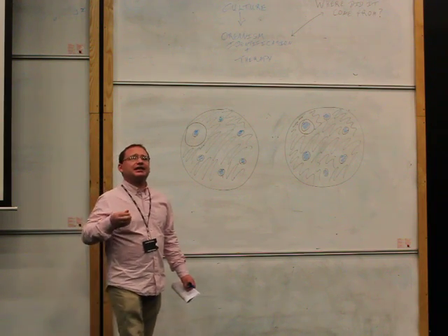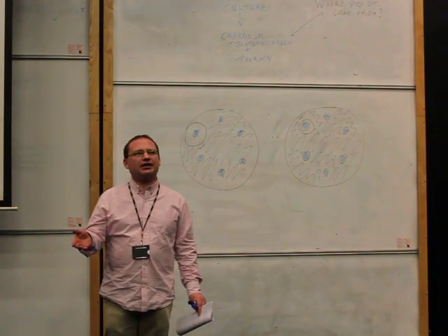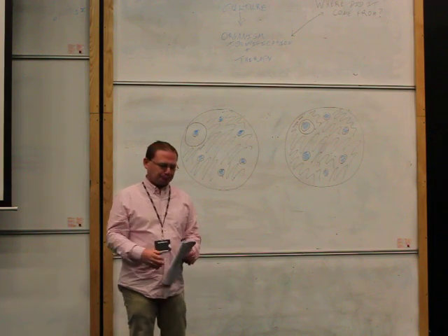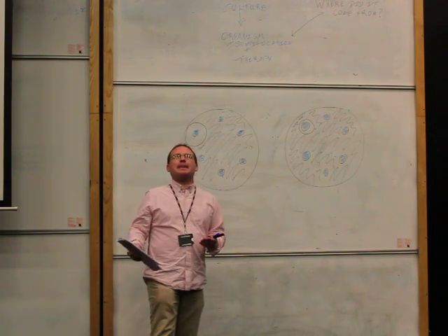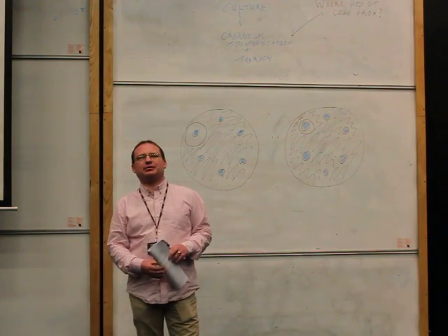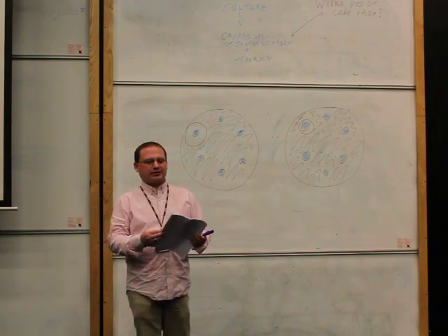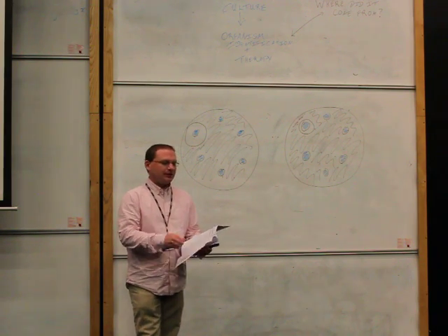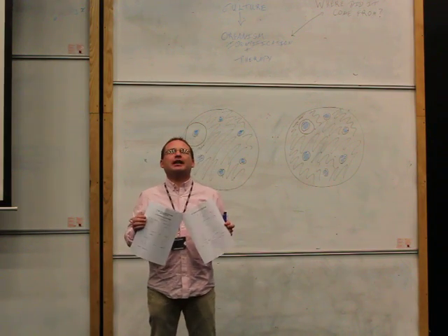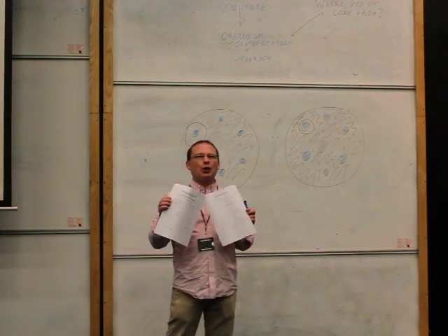His doctor has said, right, we need to take a specimen. So they've taken a swab of this infected finger, and they have now sent it to the laboratory for us to culture. So we've cultured it, and we have isolated 4 different organisms. What we want you to do, in the flowcharts A and B at the back of your handout, is follow these flowcharts and identify the 4 organisms.